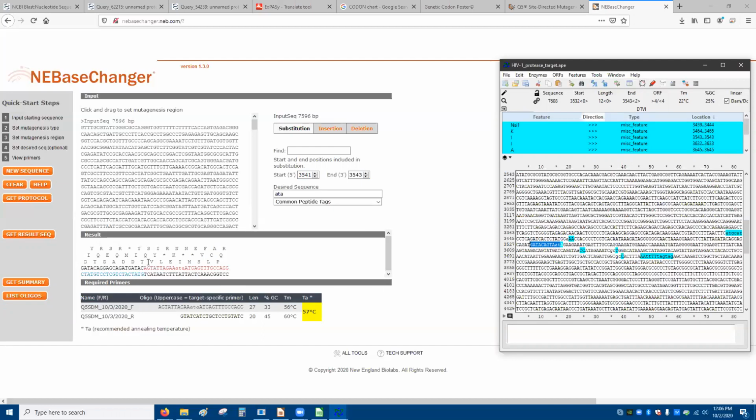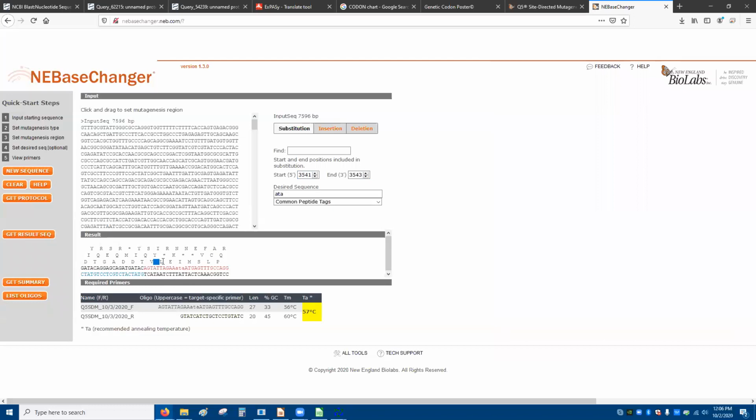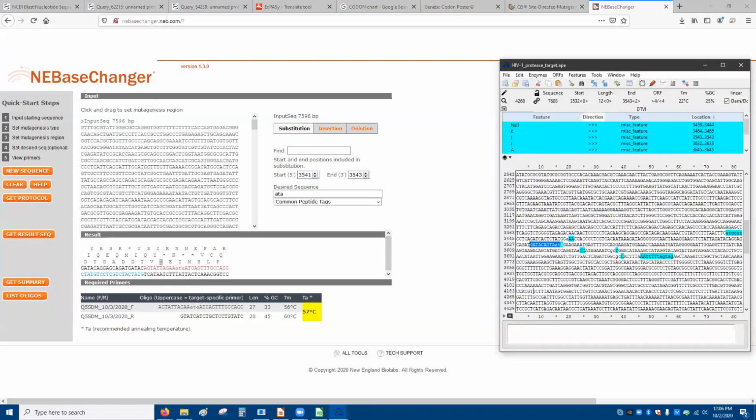So if we go down here, DTVL, that's exactly the change we wanted to make. Right. Oh no. Oh boy. Looks like we were off by something.